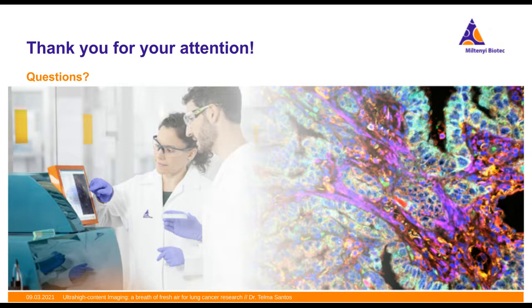Okay, thank you, Dr. Santos. Looks like we have one more question here. Can you quantify the signal intensity as well? So yes, of course, the images are all acquired and processed, and then once you have an imaging software program that can open TIFF files, which is virtually all image programs, you will have there the signal quantification with your gray values.